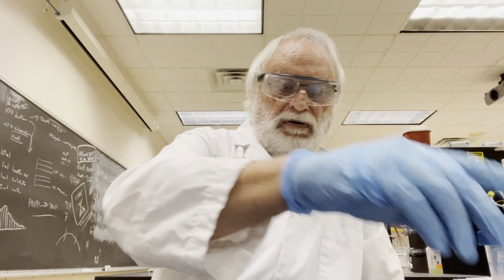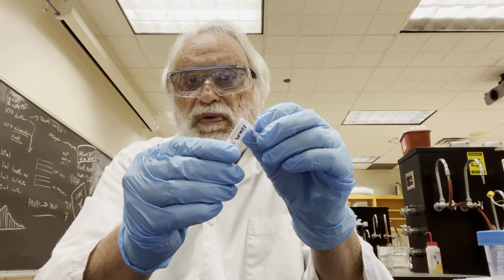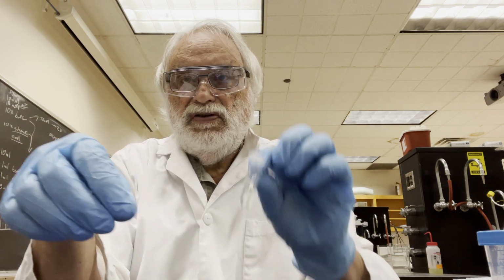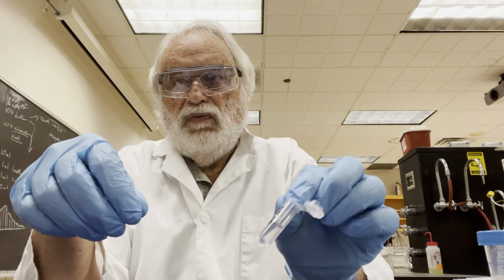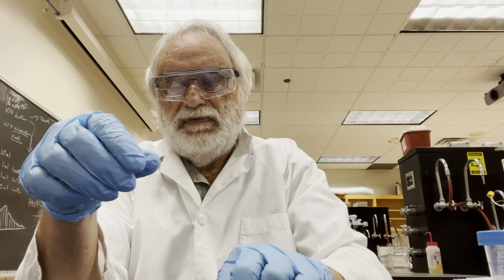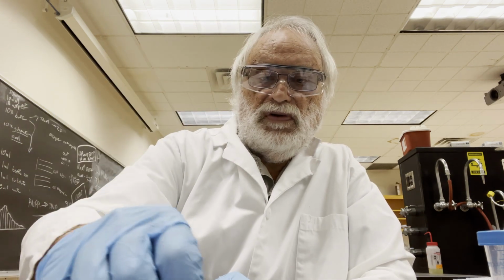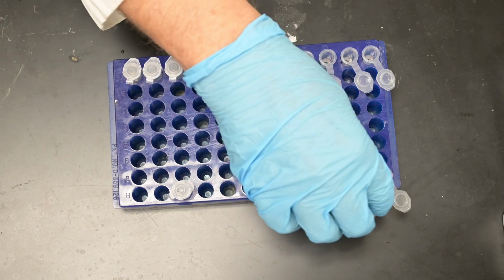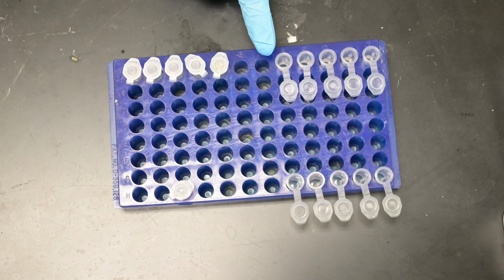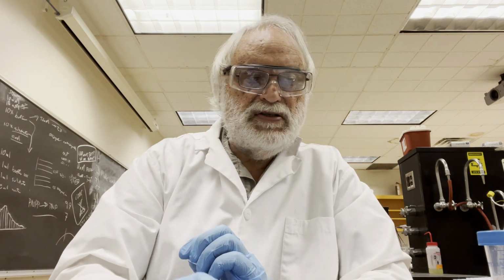So what I've done so far is I have these tubes already labeled. The first tube here is labeled 10 millimolar. The second is 5, 2.5, 1.25, and 0.625. And I have a duplicate set of tubes labeled in identical fashion. And notice that I have them lined up in terms of decreasing concentration. That makes it a little bit easier and helps prevent errors.